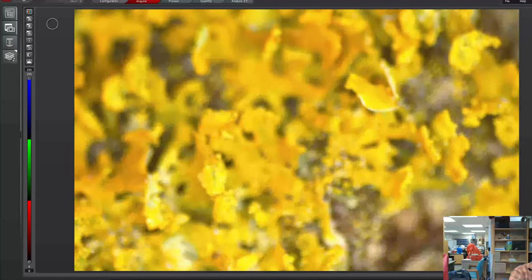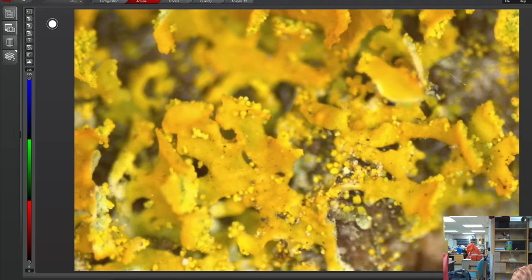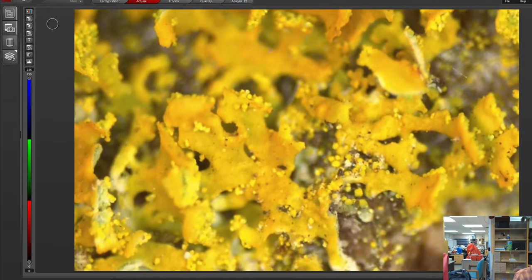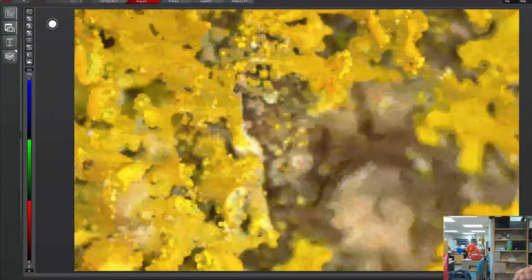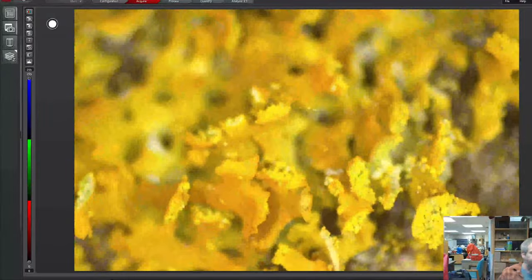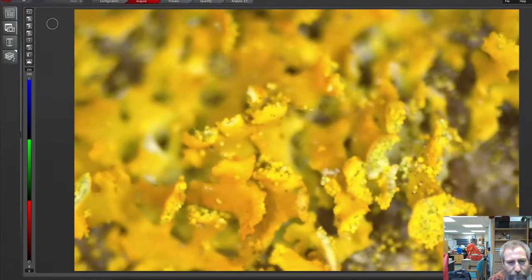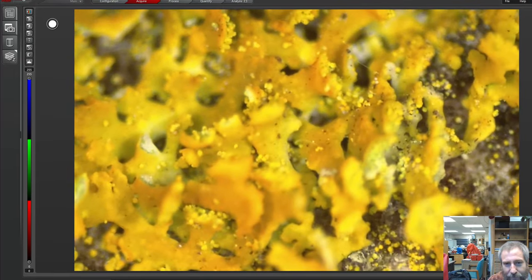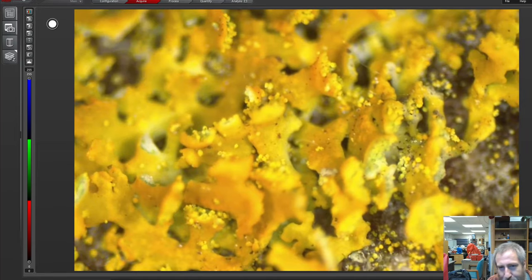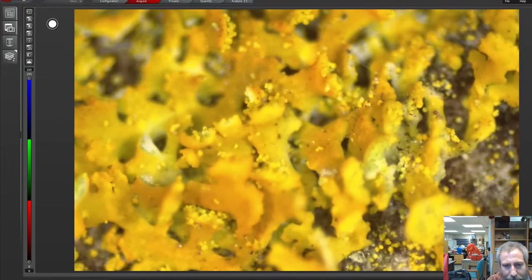And I think there's four main types of lichen, and it's based on the shape of the body. These ones are, I don't remember what they are. It starts with an F. Fructo. There's a little bug in there. See, we do look at living stuff. Yeah, it's such a bright color. But I think it's really pretty.